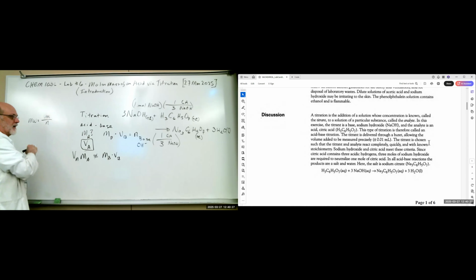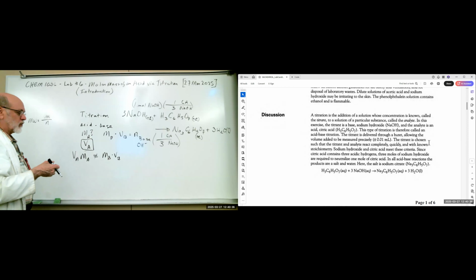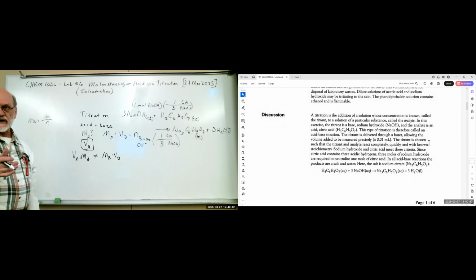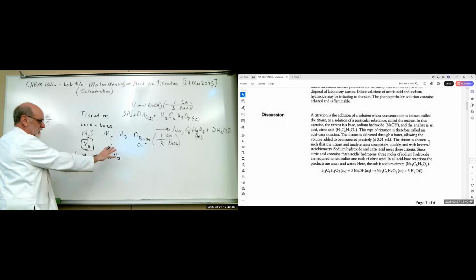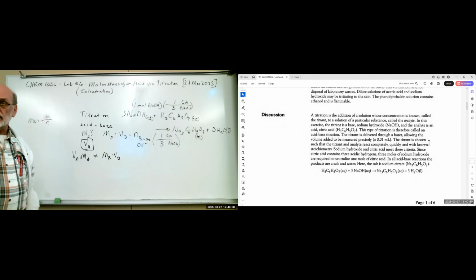Okay. Now what goes in there? Well, you measure this. The acid is a solid, right? But you have to put it in solution to get the reaction. So you measure out very accurately on our analytical balance to 4 decimal places, whatever the method calls for, and you get a mass here, and then you titrate it, and you get moles here, you calculate the molar mass.